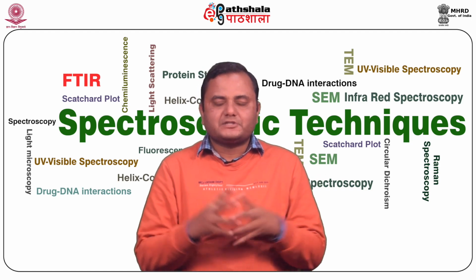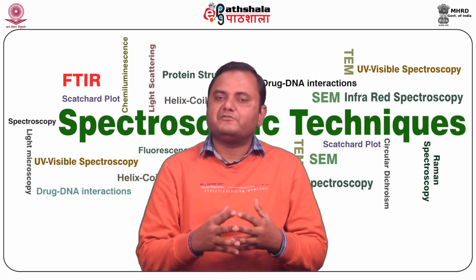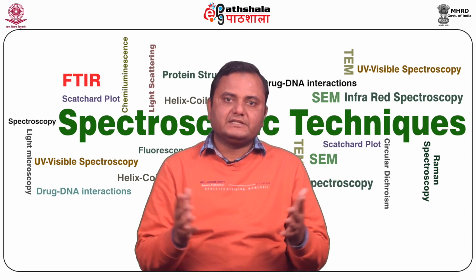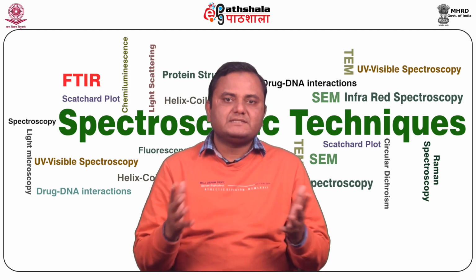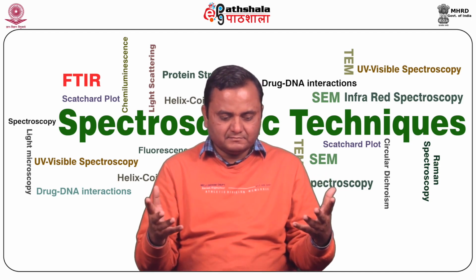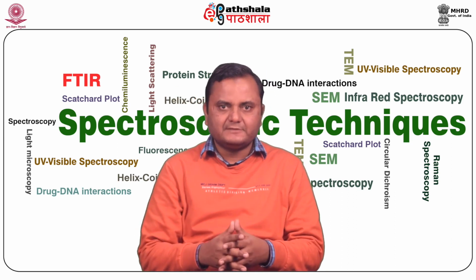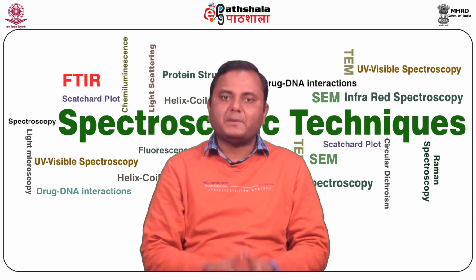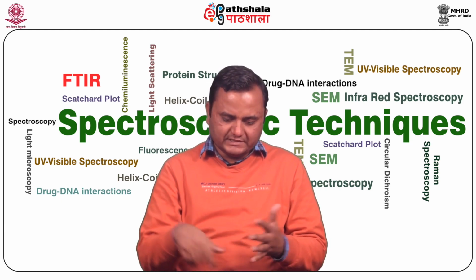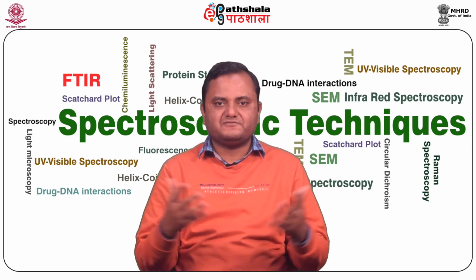Now we discuss what the structural factors are which affect the fluorescence phenomena or fluorescence spectrum. Because by fluorescence you may get information about the structural properties of any molecule under investigation, especially for studying the structural properties of biological macromolecules. So fluorescence is expected in molecules that are aromatic with multiple conjugated double bonds and a high degree of resonance. Only those molecules have fluorescence tendency which have a high number of pi electrons, which can easily absorb light and get excited. Generally it doesn't happen with sigma electrons; only pi electrons are involved in fluorescence, and it is expected in polycyclic aromatic systems, because resonance can easily occur there, and because of the resonance, the fluorescence phenomenon can be observed.